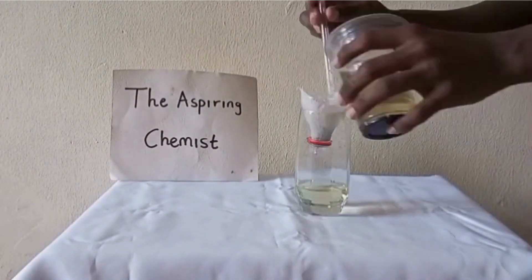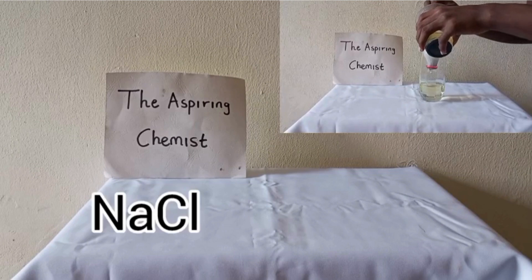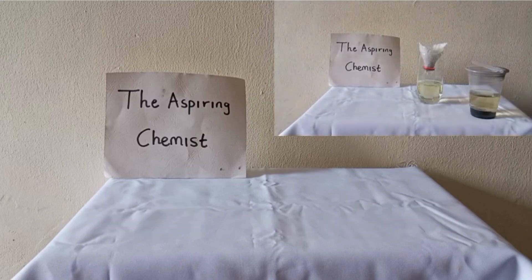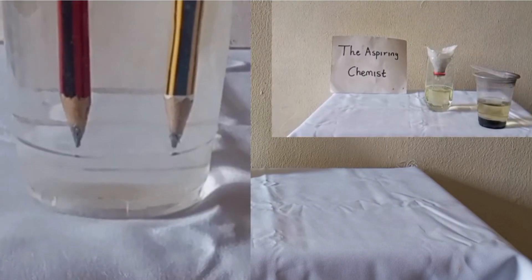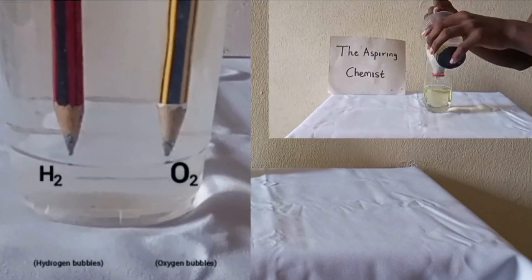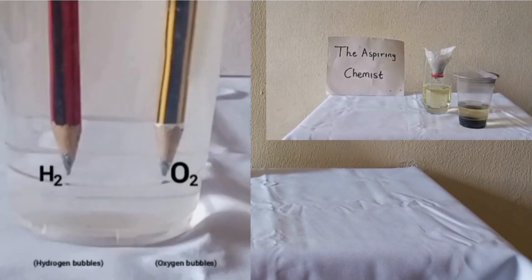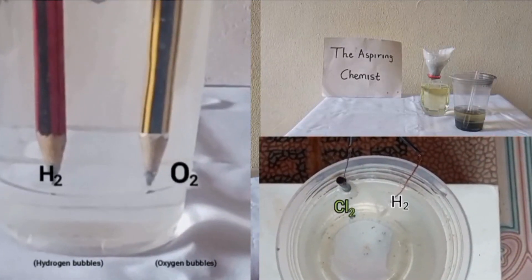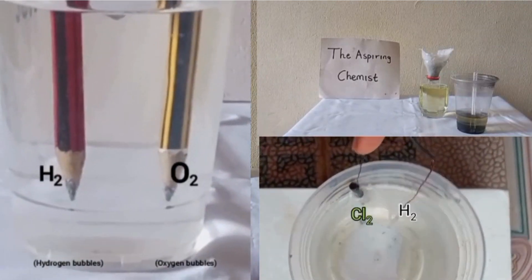While it's filtering, I'm sure some of you are wondering why sodium chloride changed to sodium hypochlorite just by the use of electrolysis. In a previous video I said that hydrogen and oxygen gases are released at the electrodes, but in this video I said that hydrogen and chlorine gases are released. So why the difference?